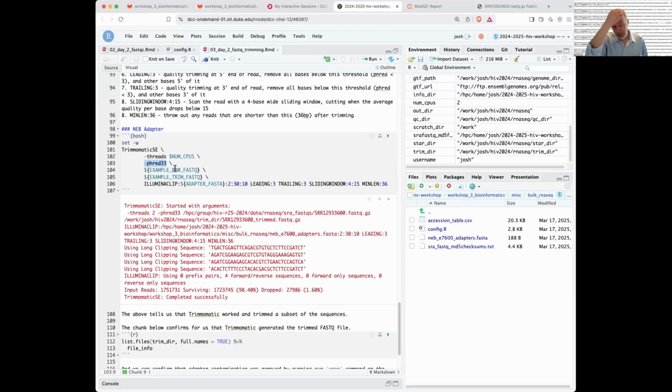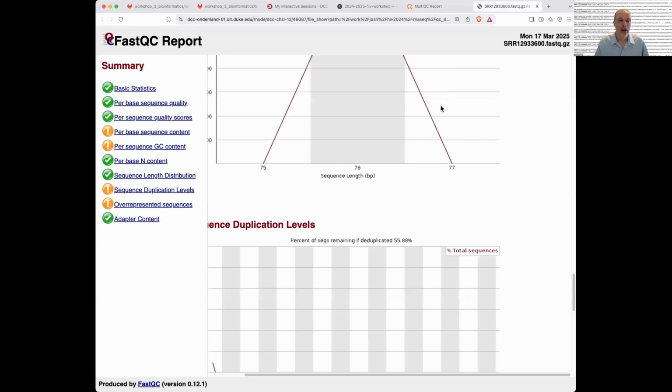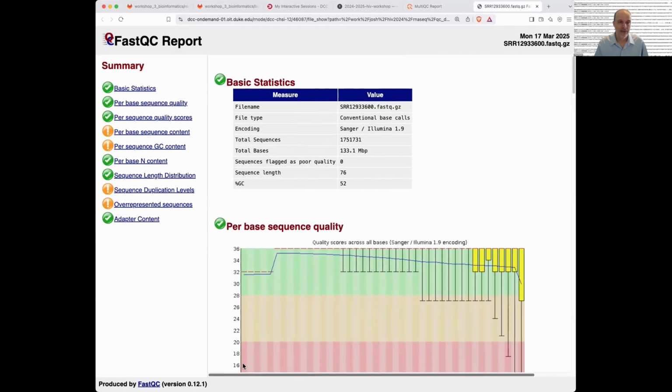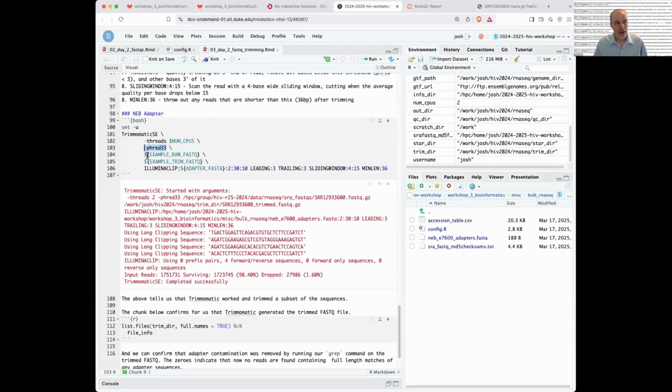It's an unfortunate feature of FASTQ files that there's no perfect way to tell from the FASTQ file whether it's Phred33 or Phred64. There's a couple of ways that you can get a pretty good guess, but it helps if you know. Actually, I can tell you. In the FastQC output, this helps tell you. But again, this is estimating from the data. It can be imperfect.